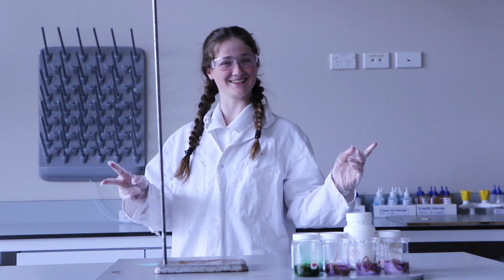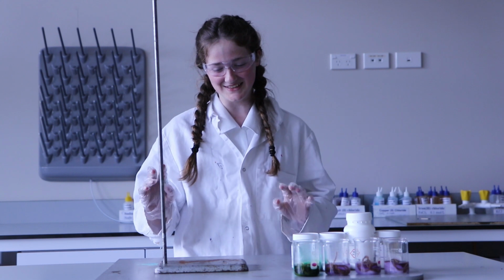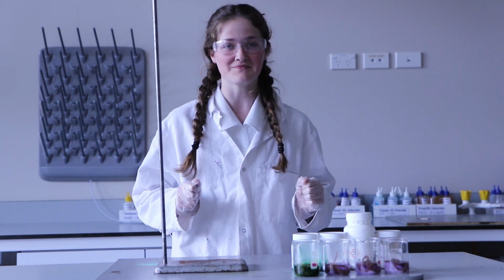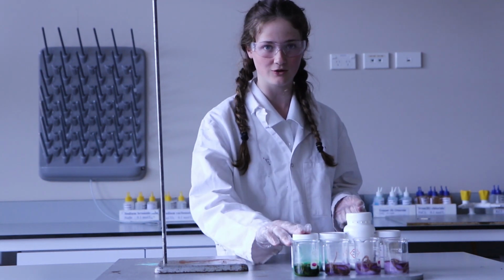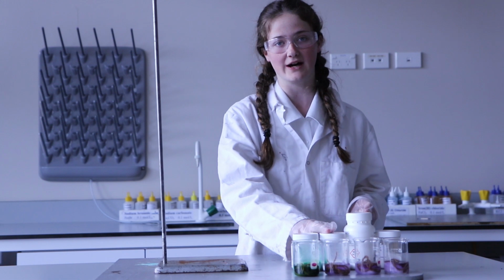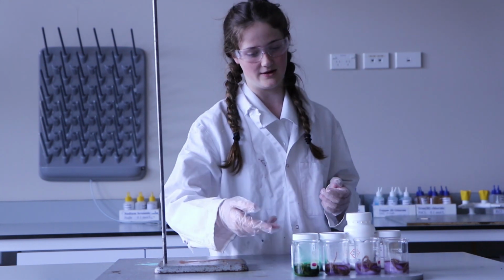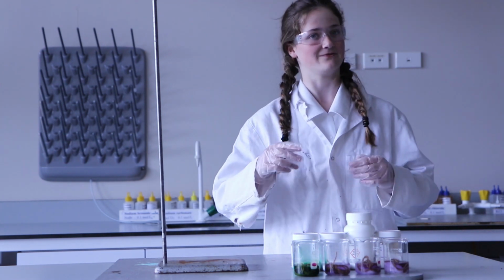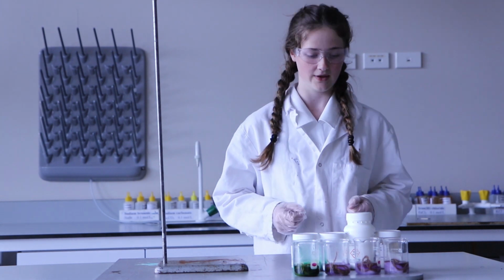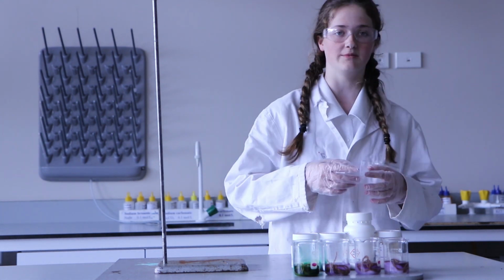This is Flaming Colors Part 2, Electric Boogaloo. We are going to be doing pretty much the same thing as Paddy did, but better. We've got our four chemicals here: our copper chloride, our sodium chloride, lithium chloride, and potassium chloride. This one burns a green-blue, this one burns orange, but a different tone than a normal flame. This is lithium, it will burn red, and potassium will burn purple.